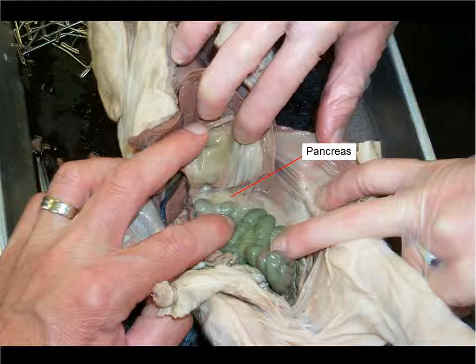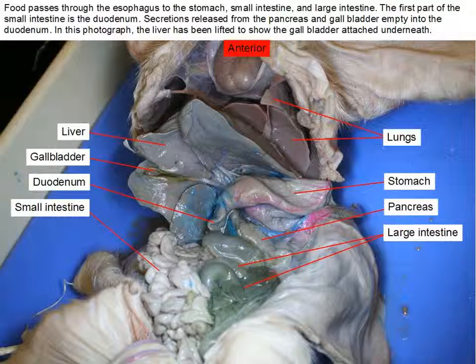Okay, the gallbladder, I think you can actually see in this one, there might be a better picture coming up, is something like here. It's over on the pig's right side, your left, if you're looking at it head up. Yes, indeed. Here's a nice gallbladder. The liver's very obvious. You need to know the directions on your stomach in general.